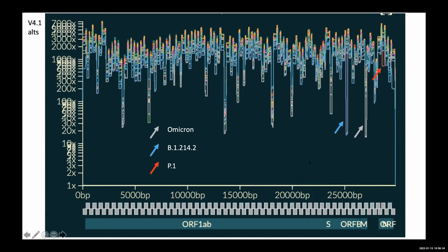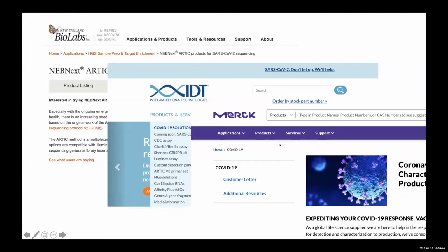And if you investigate those in a little more detail, you can see that those are genuine. They do have mismatches to those references, to those lineages. We just didn't include those mutations in the training data, which is why it's led to this. So it all looks as expected.